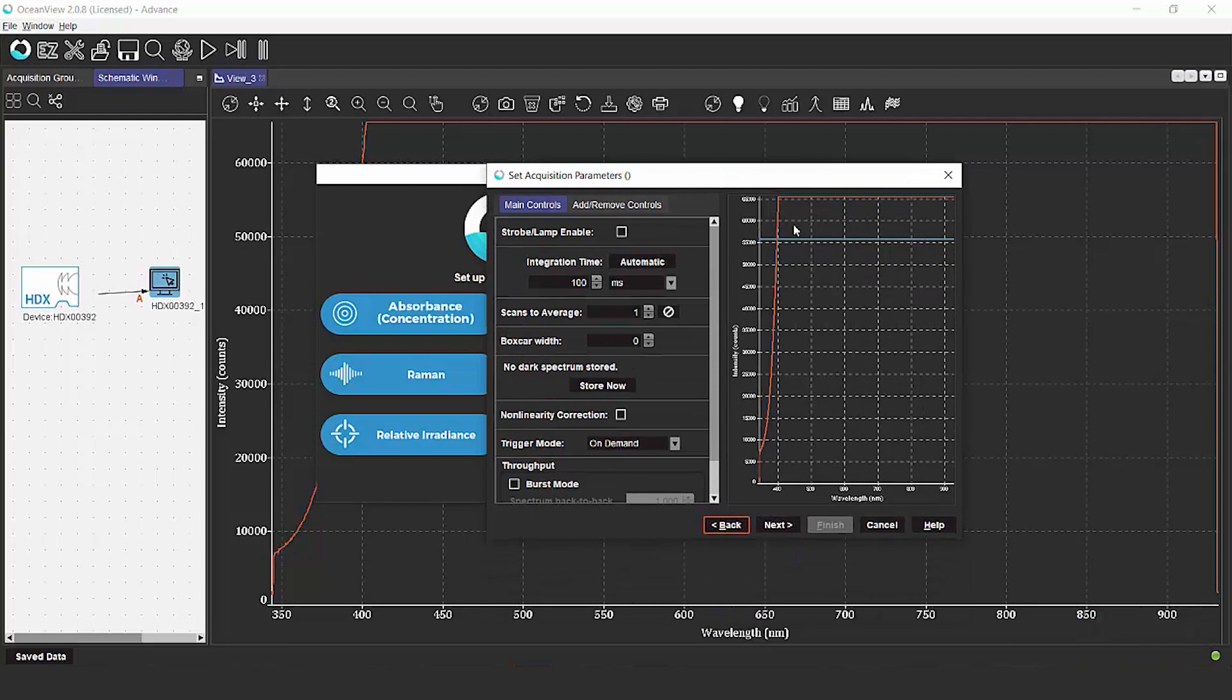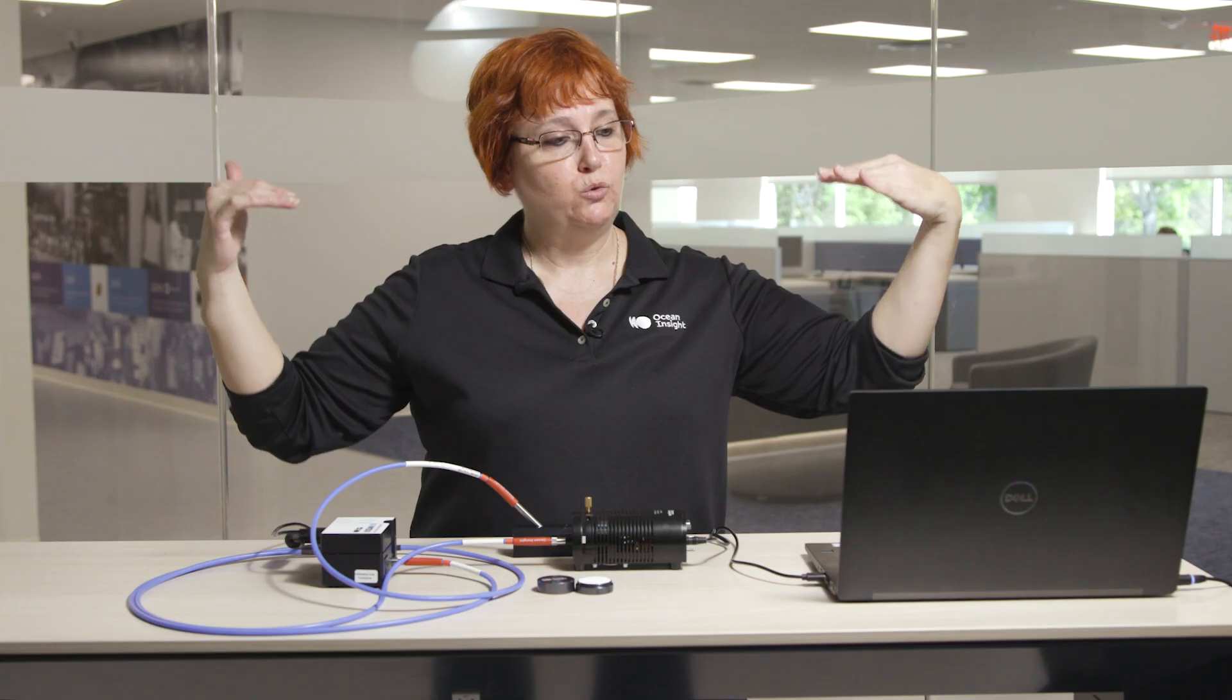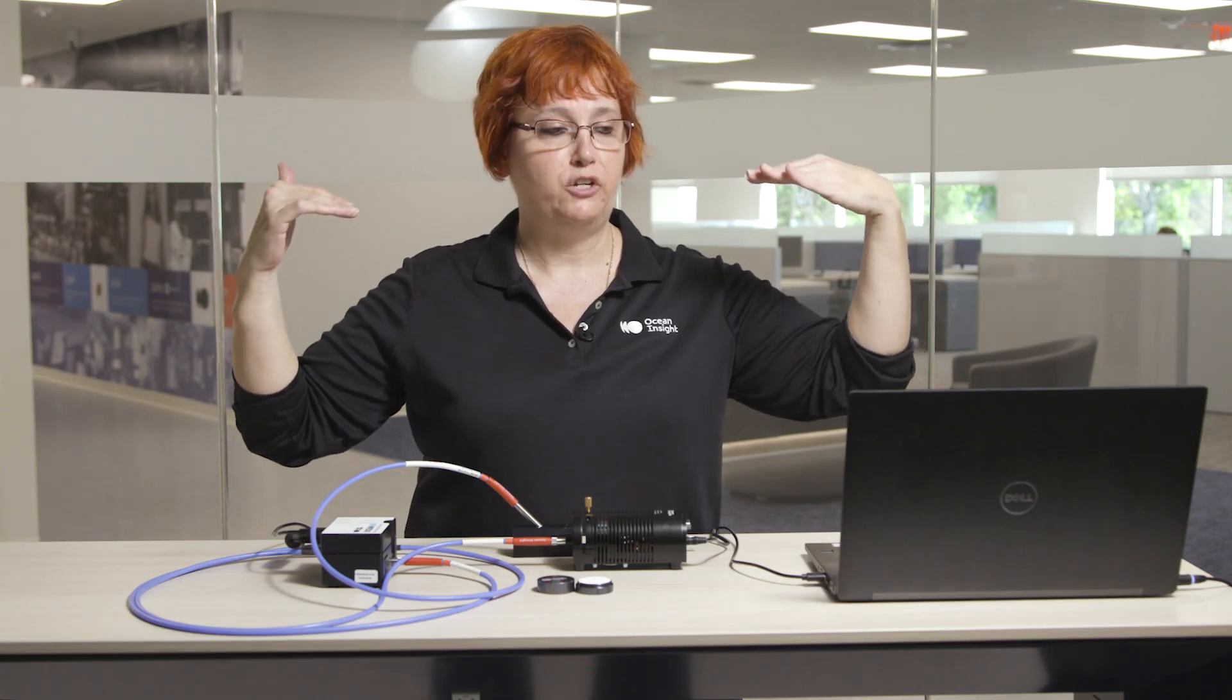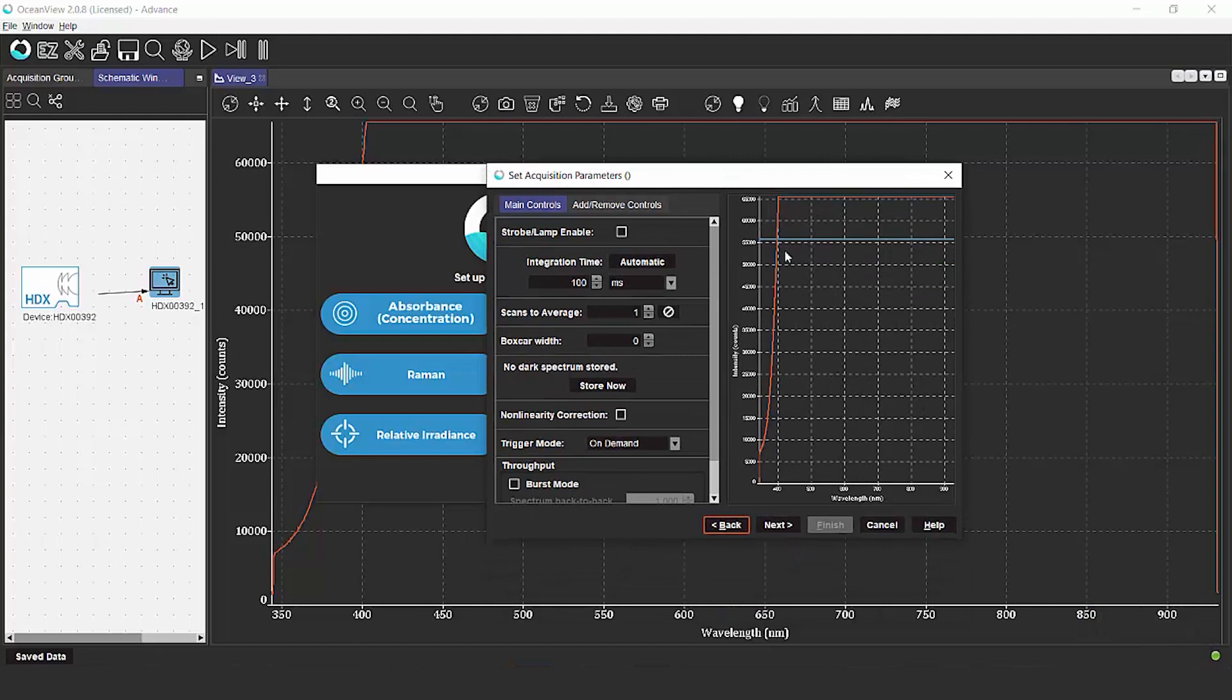How would you know that? We have a flat line that grows across the top of the spectral window, which is indicating that the spectrometer can't see any more light. It's completely saturated.